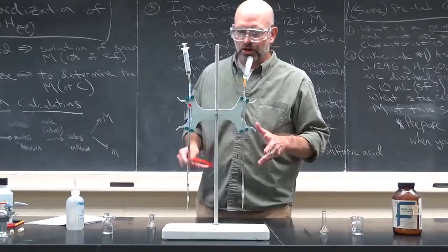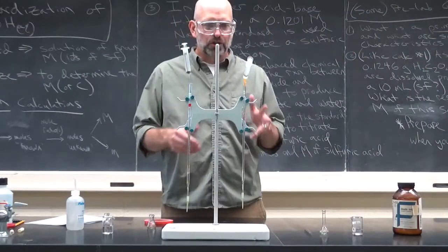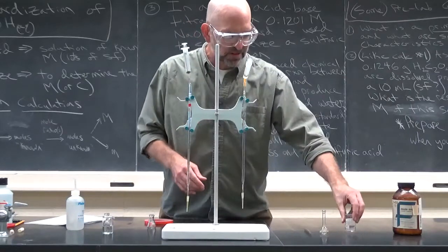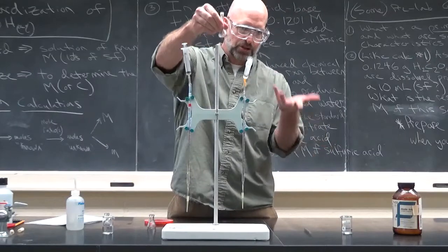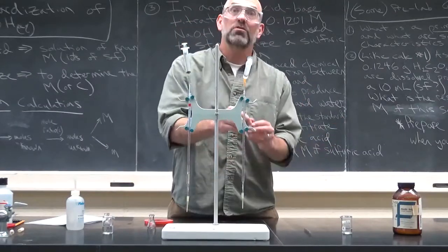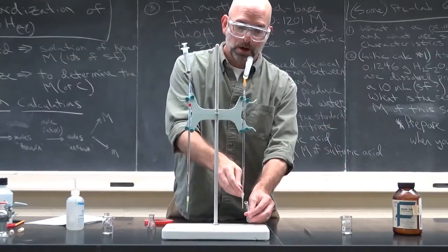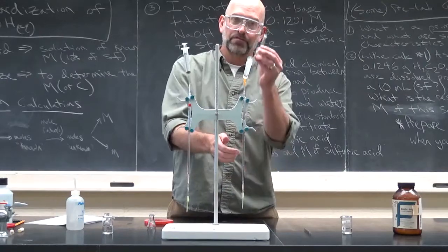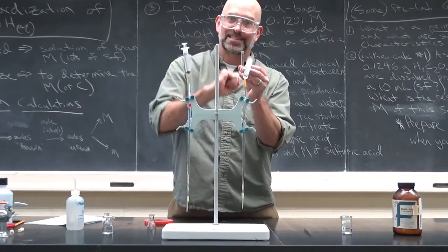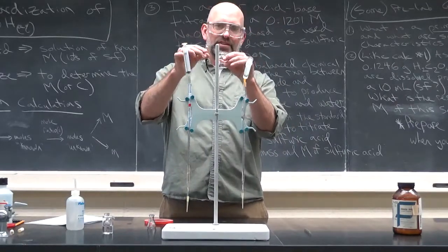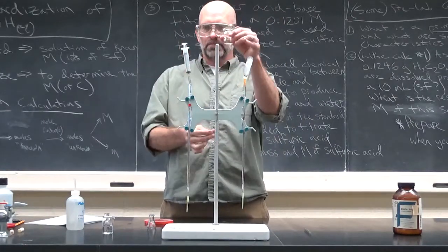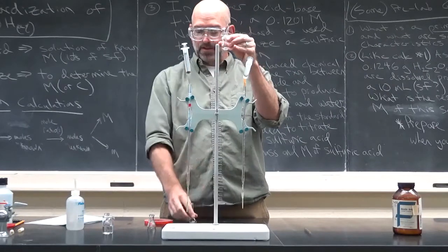So here's how I'm going to set it up. One burette is going to be used to dispense. One burette is going to be used to titrate. I recommend labeling things, and I'm showing you bad examples today. So, in the procedure, you're going to use one burette to dispense your oxalic acid.